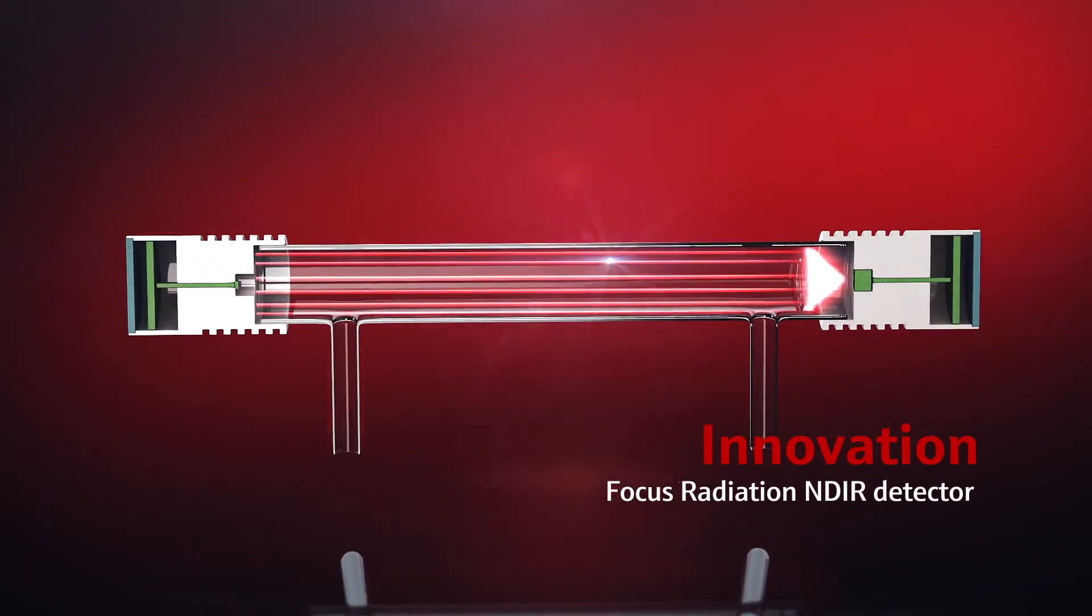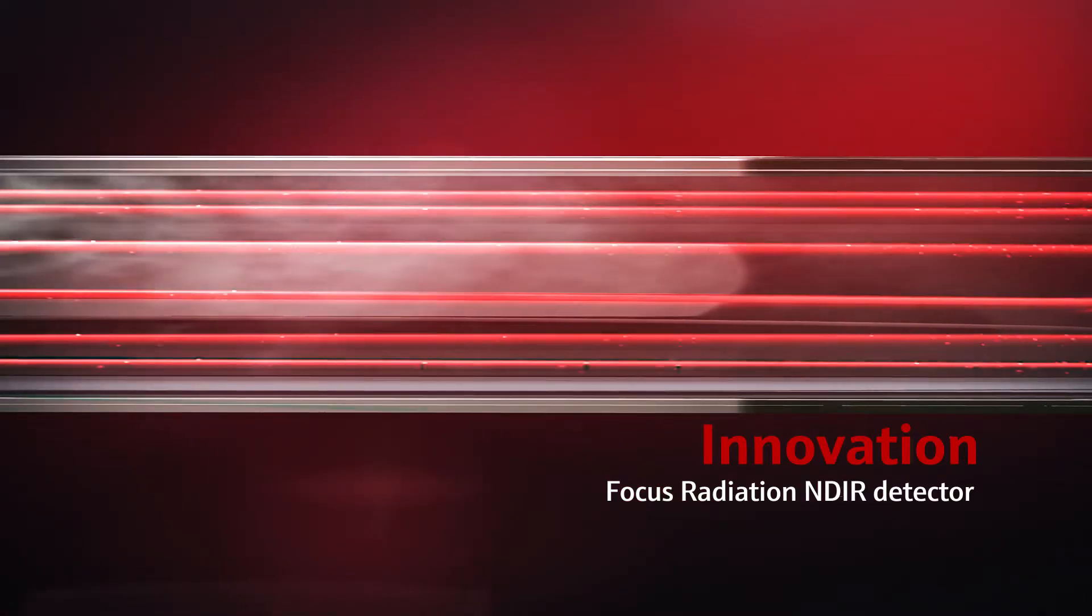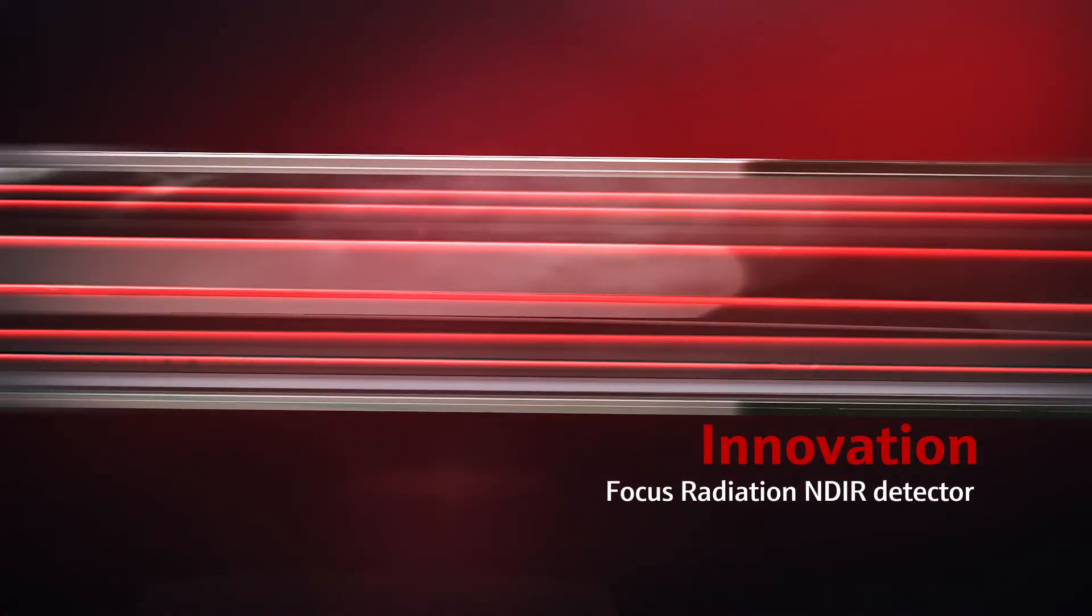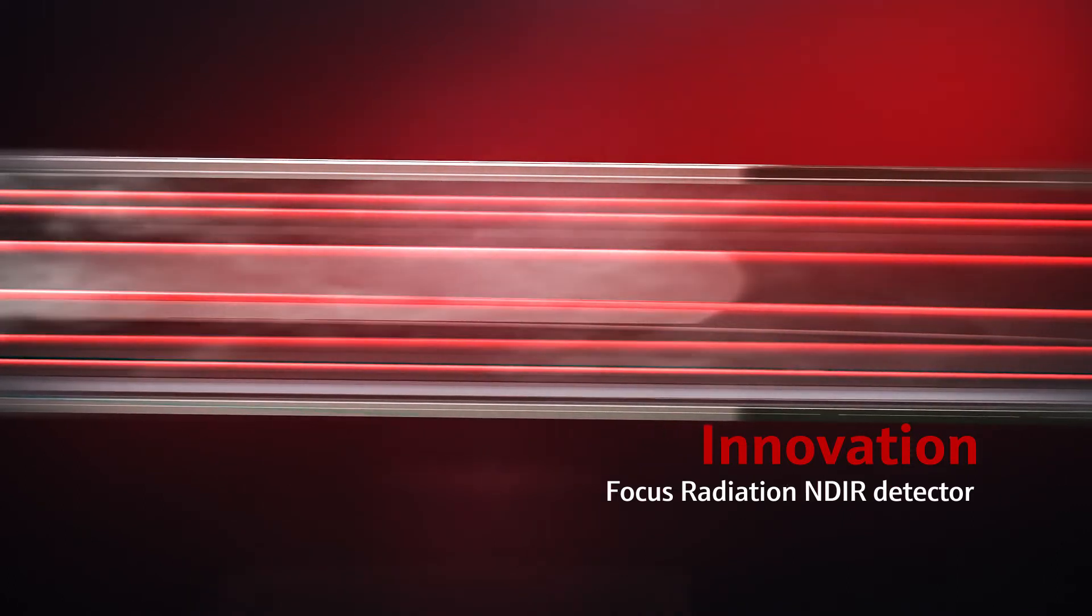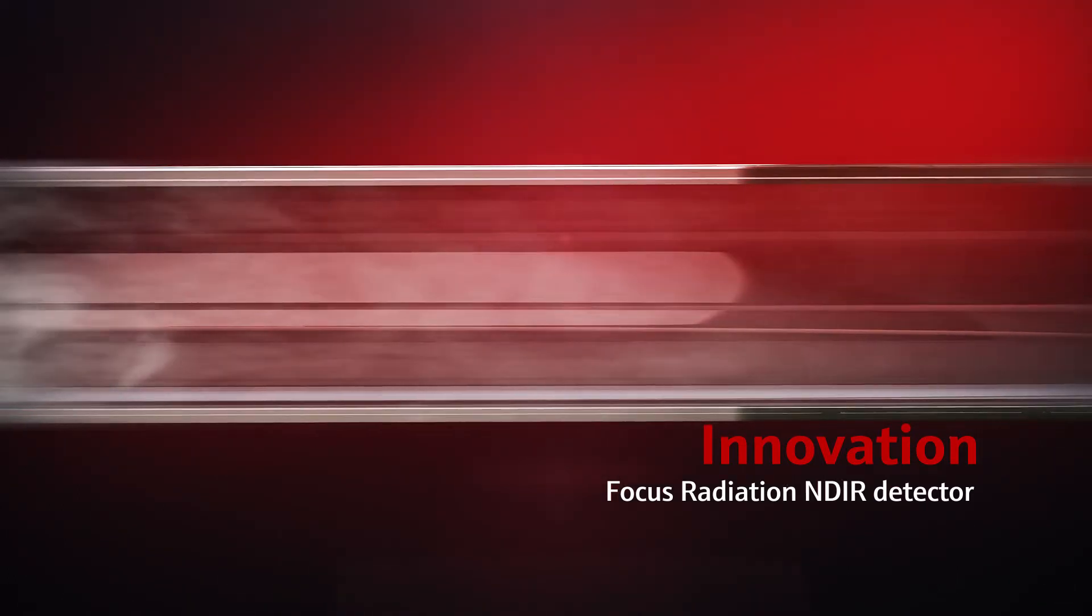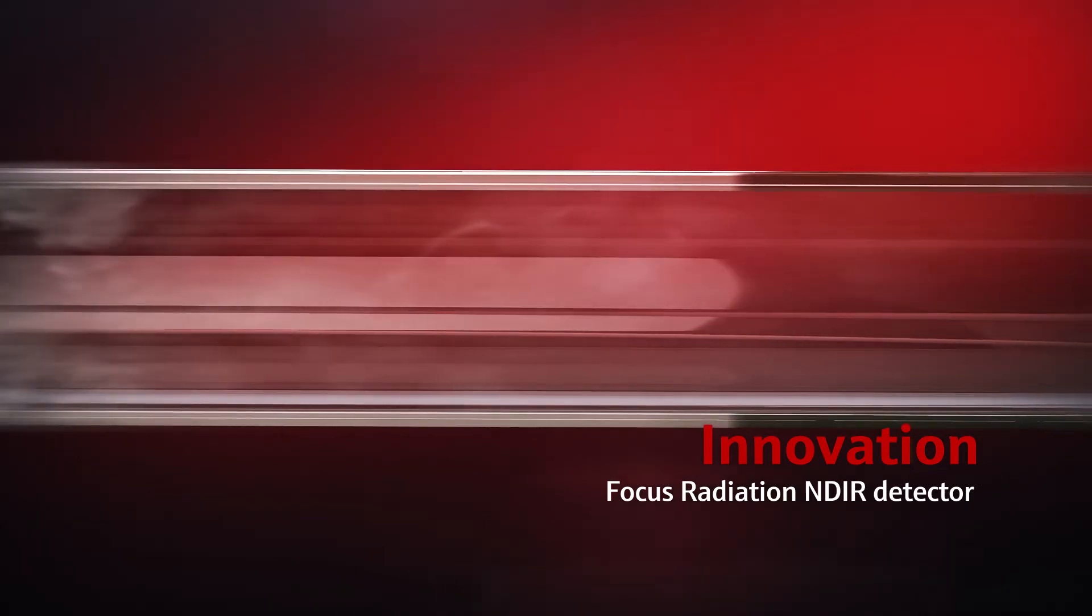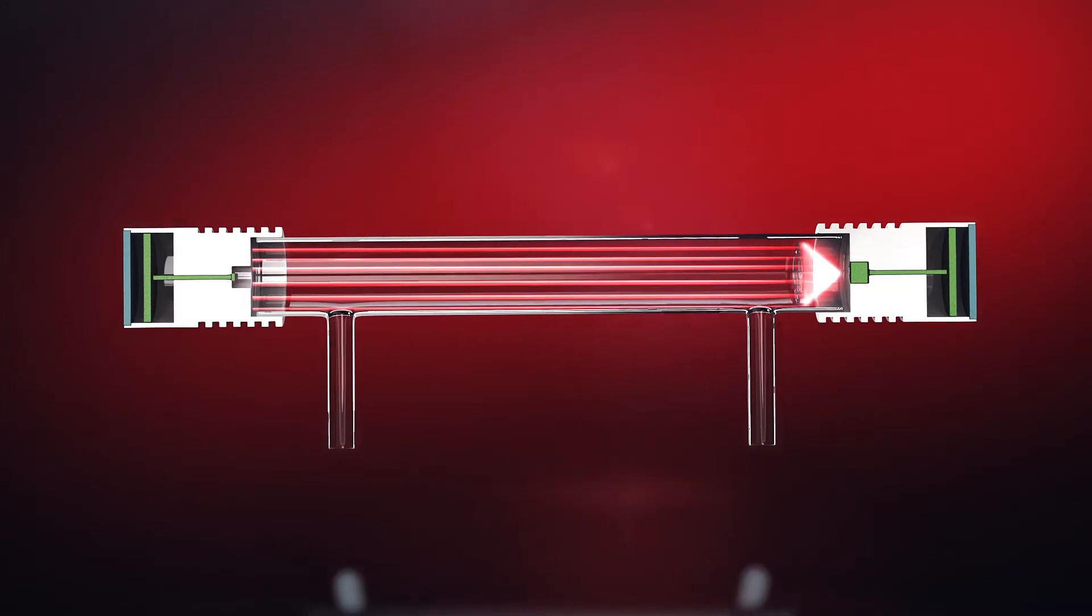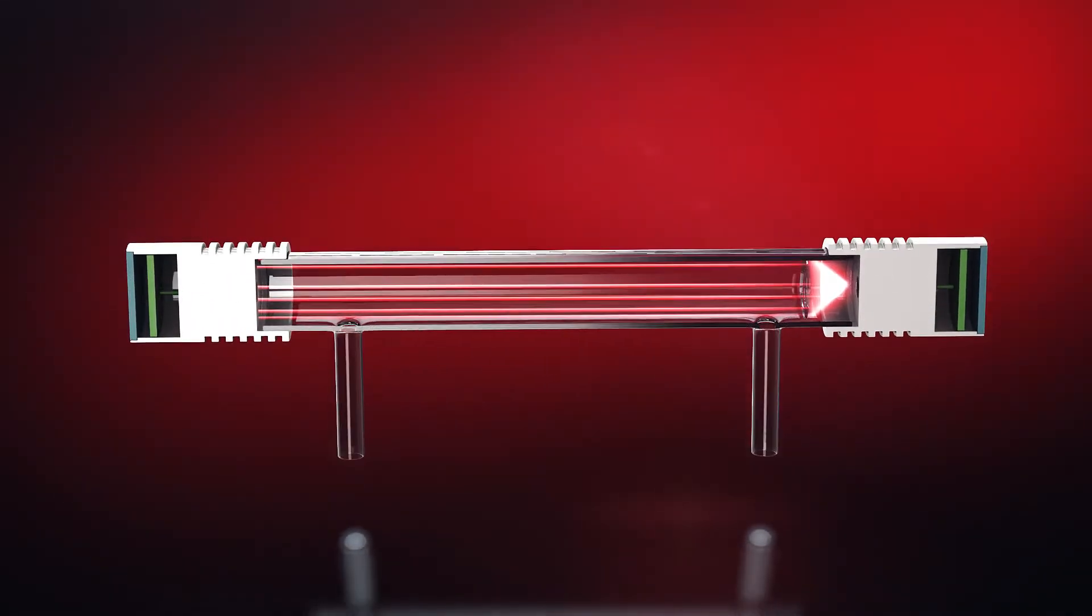As a market leader in optical spectroscopy, Analytic Jena assures that our TOC analyzers contain top quality and durable optical components. The corrosion-free focus radiation NDIR detector and the VITA flow management guarantee excellent long-term stability and reliable results.